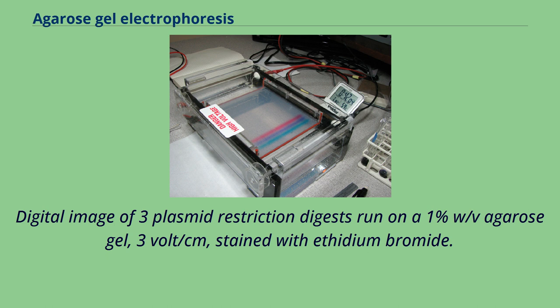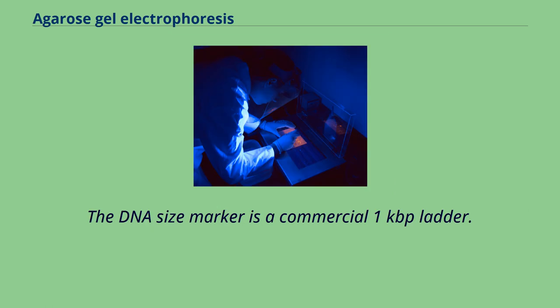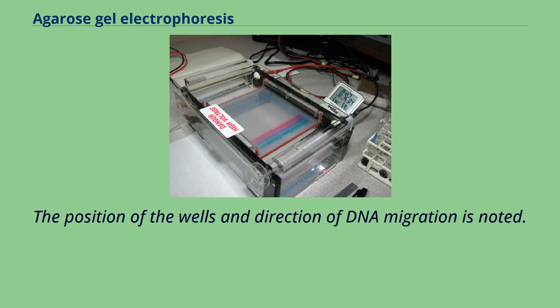Digital image of three plasmid restriction digests run on a one percent w/v agarose gel, three V/cm, stained with ethidium bromide. The DNA size marker is a commercial 1 kbp ladder. The position of the wells and direction of DNA migration is noted.